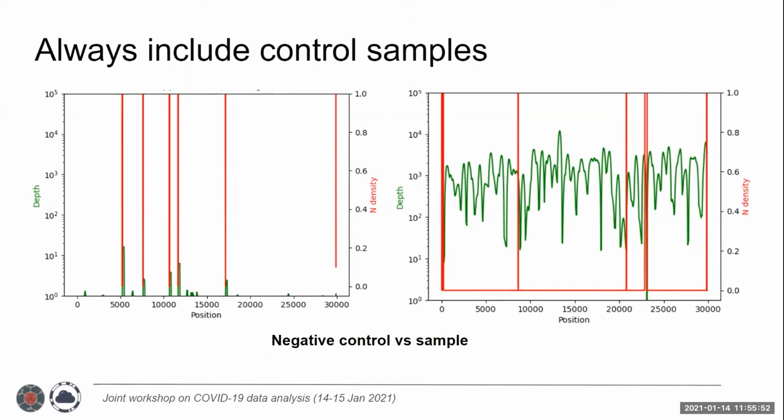Now, I have to stress this because SARS-CoV-2 sequencing has a number of peculiarities that makes this really important. On the one hand, you're heavily amplifying your starting material. And I mean heavily: if you're doing Illumina sequencing, we regularly see 1,000 times coverage up to 3,000 times coverage. And Josh mentioned the issue of barcode hopping and the variation of primer efficiency. And that together can cause a lot of confusion.